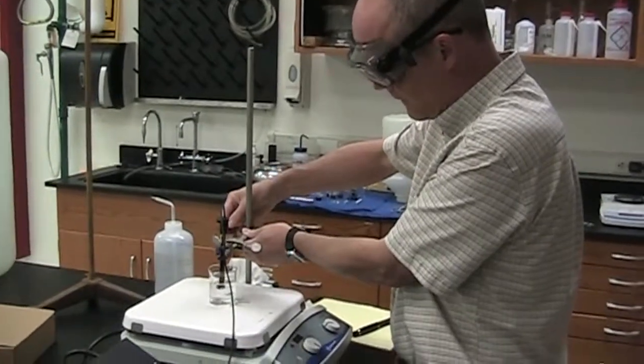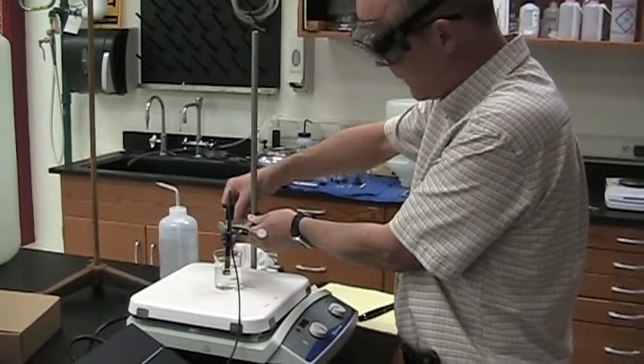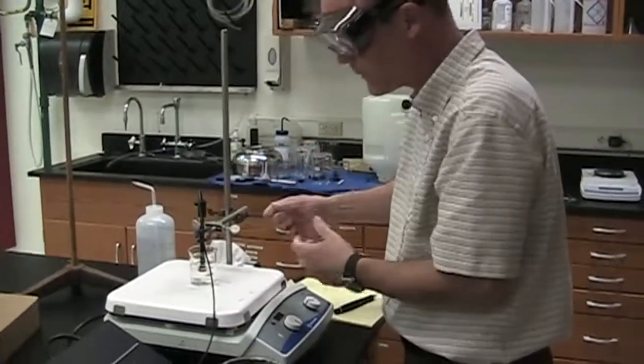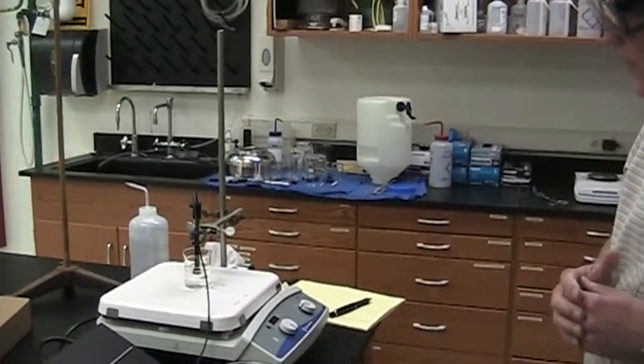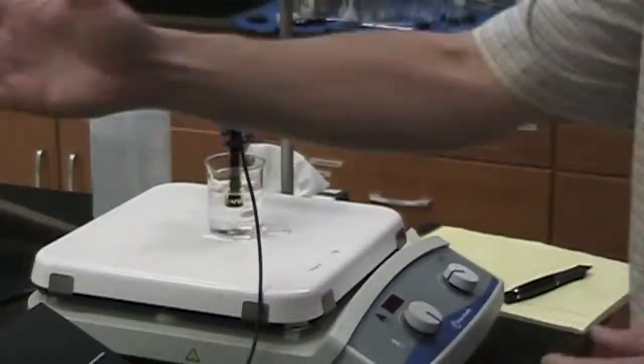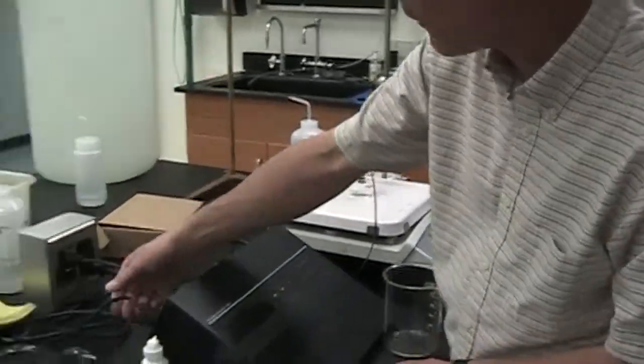Generally speaking, like pH electrodes, we don't want to let this dry out unless we're putting it into long-term storage. So from week to week or lab period to lab period, we'll leave the electrode immersed in an appropriate solution. Final step just to simply shut down the meter. All we're going to do is unplug.